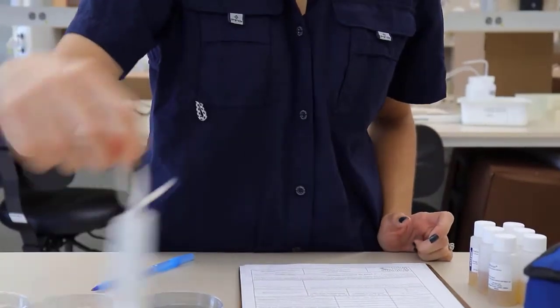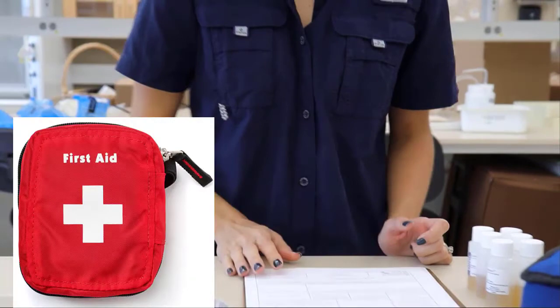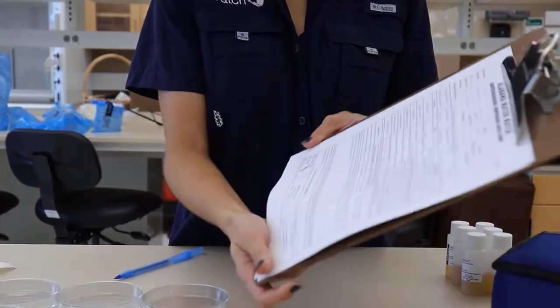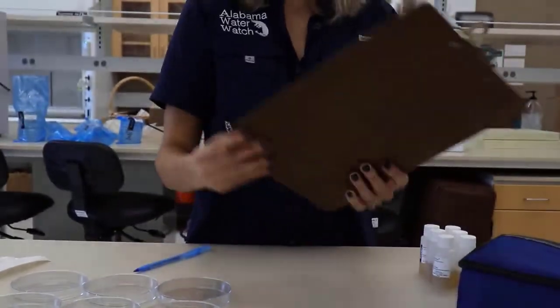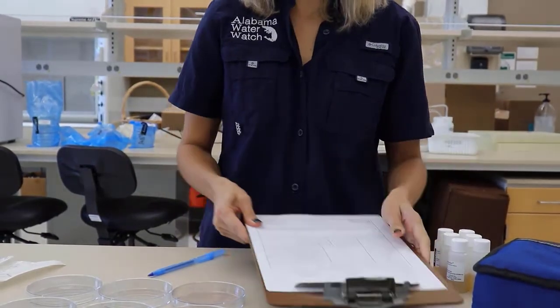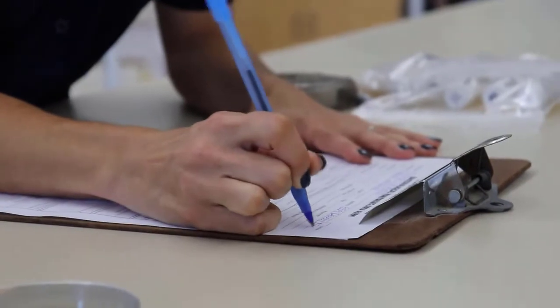Don't forget to grab some hand sanitizer to clean your hands after sampling in the field, and a first aid kit in case of incidents. Carry 1 data form per site, preferably on a clipboard. Today, we have 2 data forms since we are sampling 2 sites. And don't forget to take a pen or pencil so that you'll have something to write with.